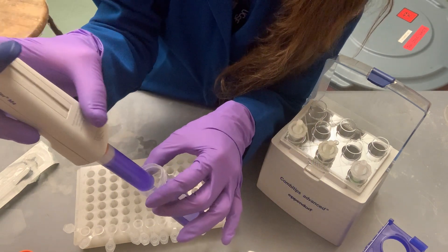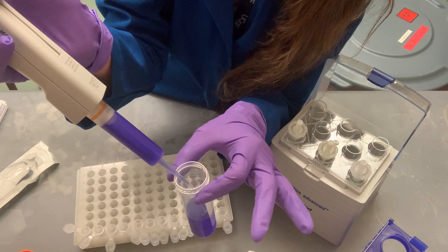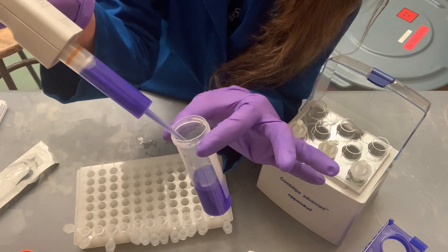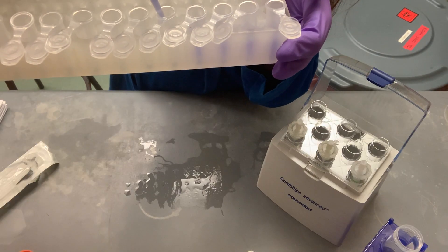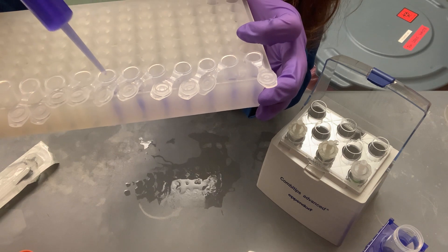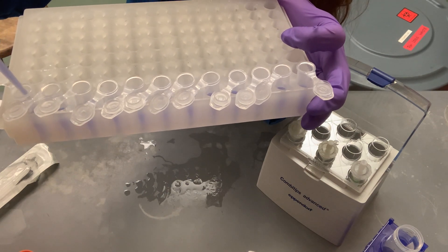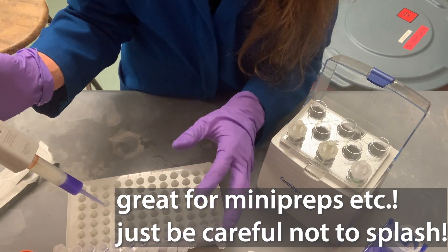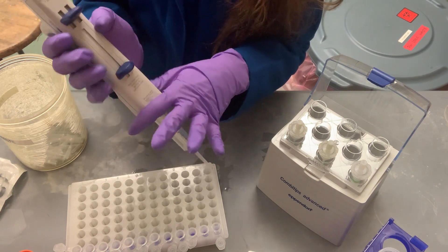When you pull the lever all the way up, the amount in the tip won't be exact, so the first dispense won't be accurate. Don't trust the first squirt — just squirt it back into your source. Then each subsequent press should give you the correct step size. Also be careful using this with things like ethanol; it can squirt on the outside of tubes, washing off labels or interfering with your samples.